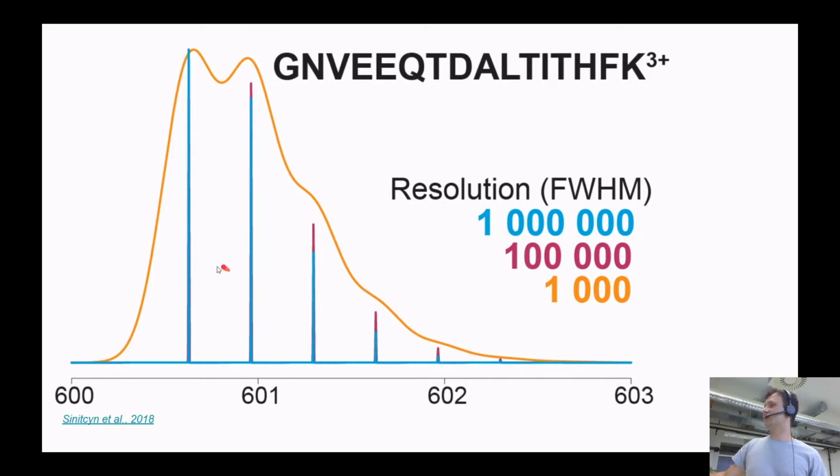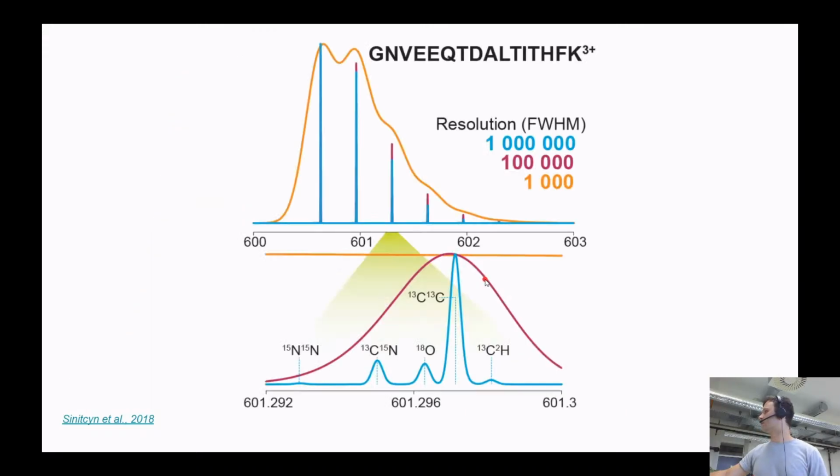What you can do next, you can take this very accurately estimated mass and multiply by charge. By that, you're going to get exactly the mass of the peptide which was before. It actually works really nicely, and it's actually used a lot in the case of identification. Probably we'll discuss later. Okay, cool.